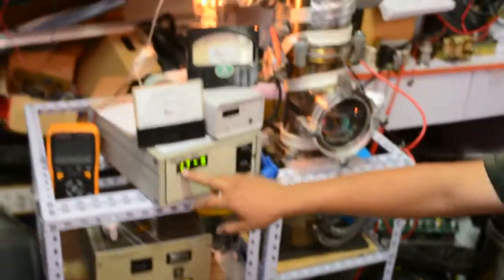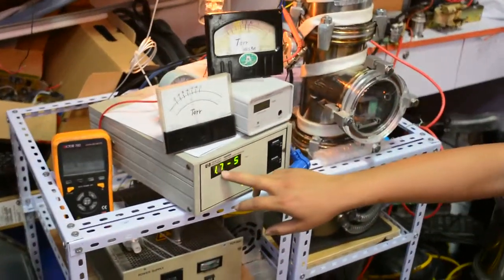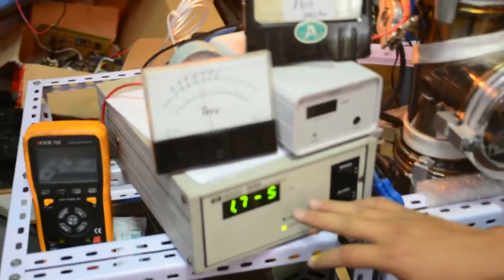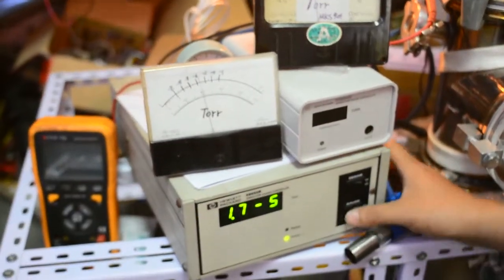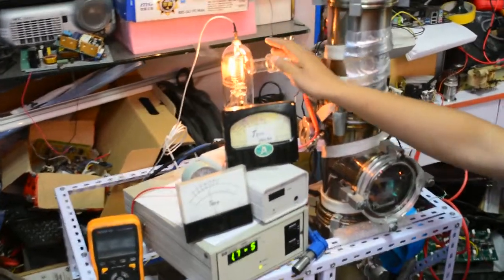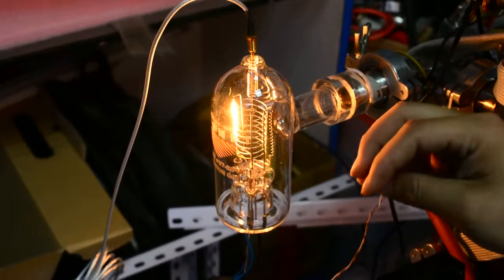Now it is dropping to 1.7 to the minus fifth torr. Then I will show you the gas operation of the vacuum gauge. Basically, this ionic gauge is basically a triode vacuum tube.